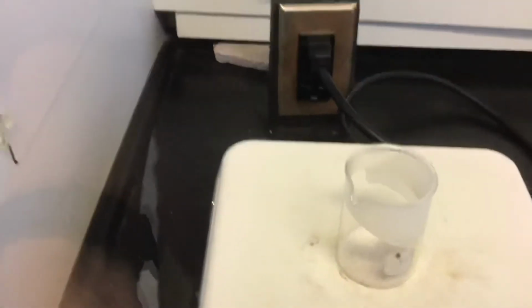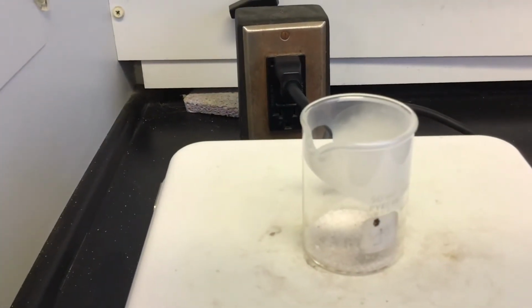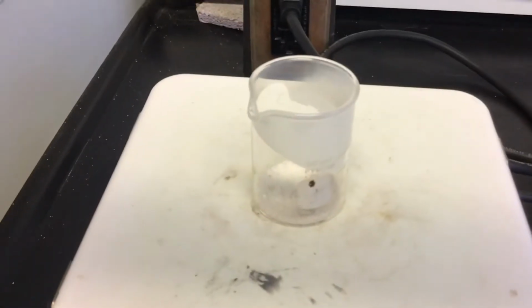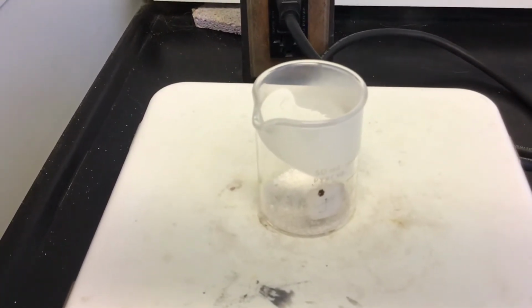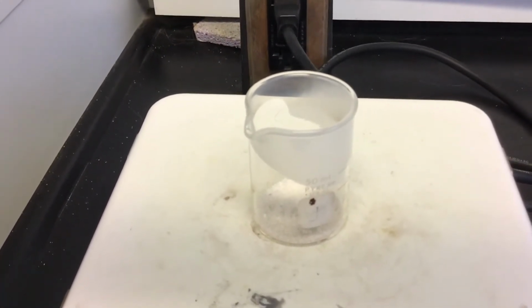Look at that. So right here, you can see that film of whiteness on there. So the ammonium chloride has gotten onto the sides of the beaker. So now we're going to try and cook that off the sides. But the ammonium chloride in the main sample seems to have sublimed.